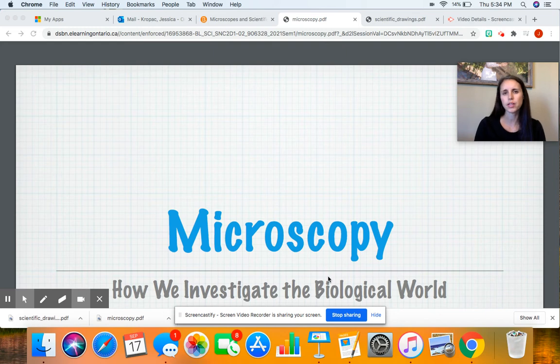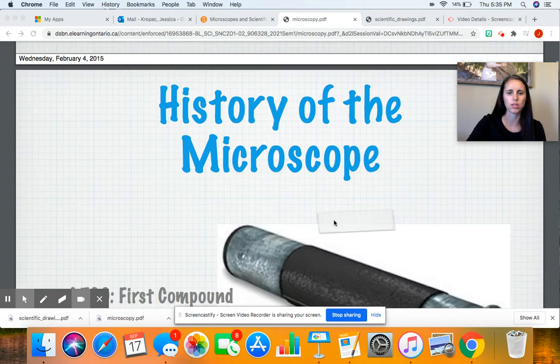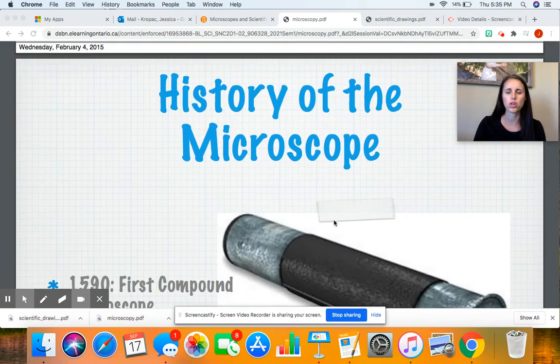So now that we've talked a little bit about cells and what you can see in cells, now we're going to talk about how you might see cells and how you might study these things. Biologists use a tool called a microscope in order to actually see cells, and it's really how we investigate the biological worlds. So, a little bit about the history of the microscope.